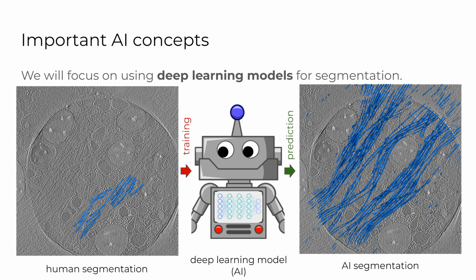For today's workshop, we're only going to tackle the AI tools in Avizo and Ilastik where the model is given to us. We're not going to deal with engineering the models, like deciding how many layers there will be, what type of layers, and so on.